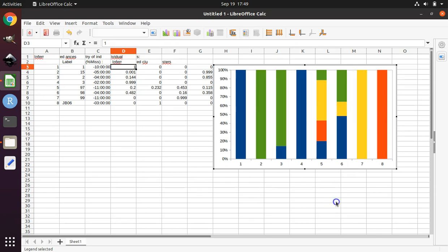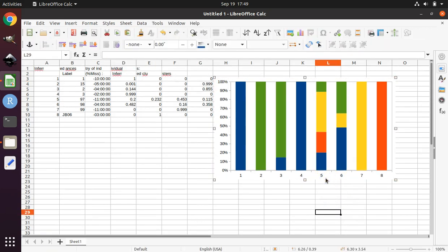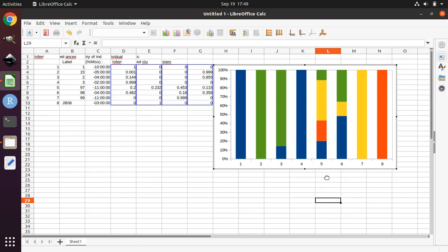By the way, if you ever are having trouble editing on the graph, it might be because you haven't entered inside of the graph. If you ever get out of it, you may need to double click on it to go back inside to where it's editable.